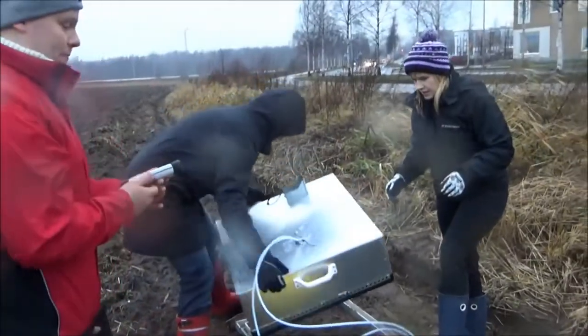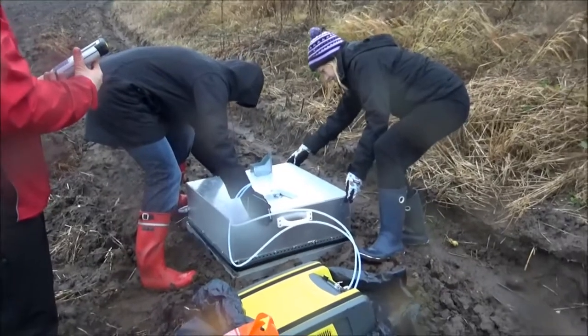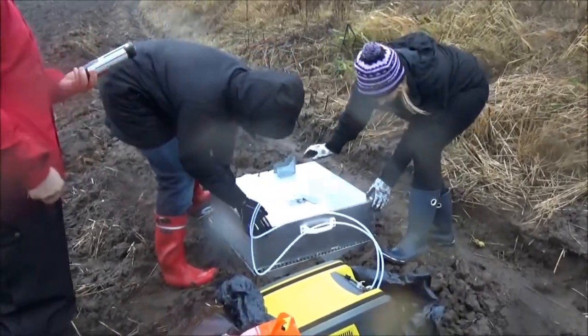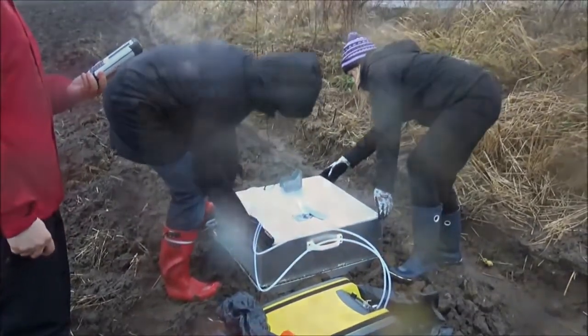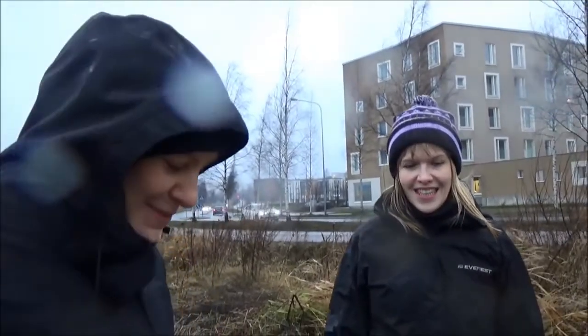The next measurement site was an agricultural field, also situated in northern Helsinki. The experimental setup was exactly the same, and the field was expected to emit more nitrous oxide. We are doing chamber measurements on the agricultural plain ground to see whether we see any nitrous oxide emissions. We have a tiny increase in nitrous oxide to indicate that we have an emission.